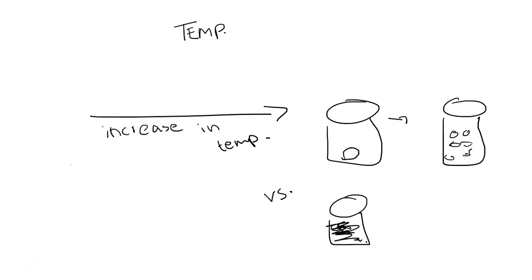The hotter the temperature, and in this case we have water, the hotter the water is, the faster the solute or the salt dissolves. Okay? So it turns out it was definitely a lot faster than the other two, cold and room temperature. Hot water will be a lot faster. So again, this is really important to note down.